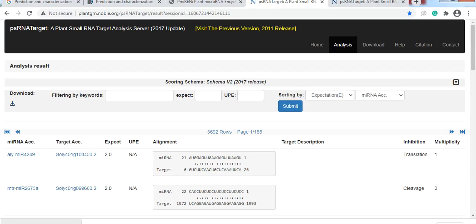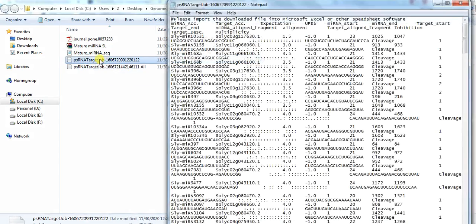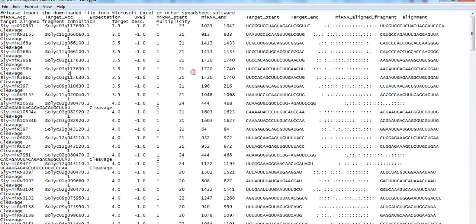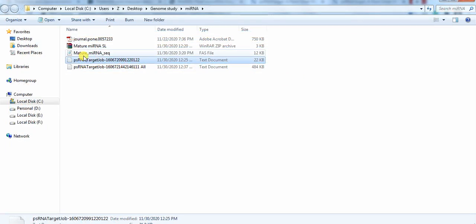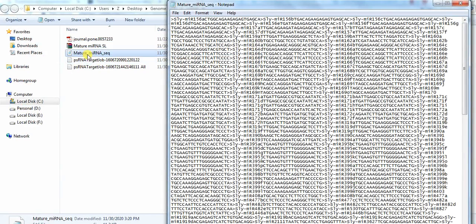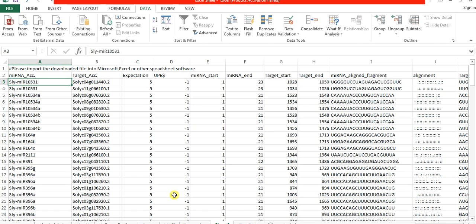If you want to know whether a specific microRNA sequence is present in your gene family or not, you can select only that specific microRNA. Open the list of mature microRNAs, select all, copy, and paste them into the Excel sheet.